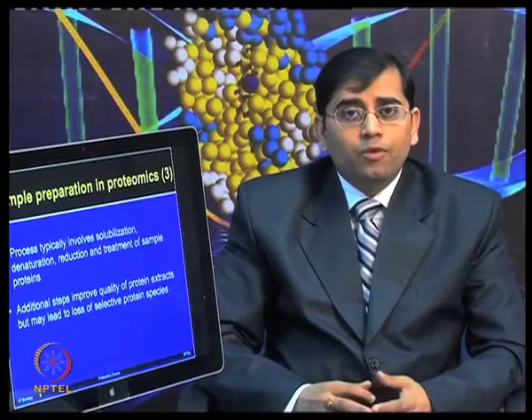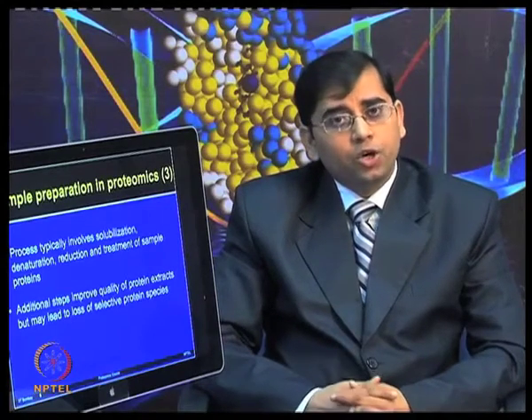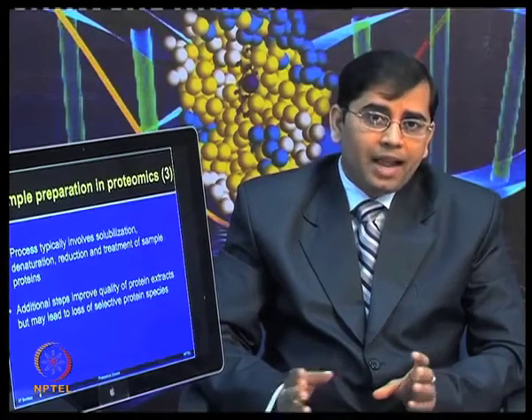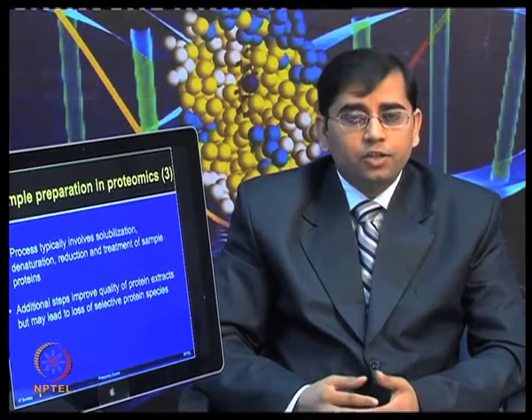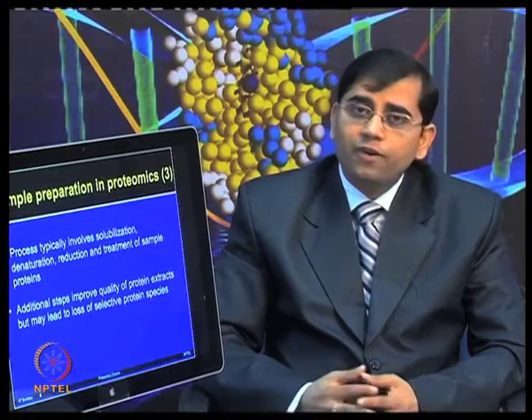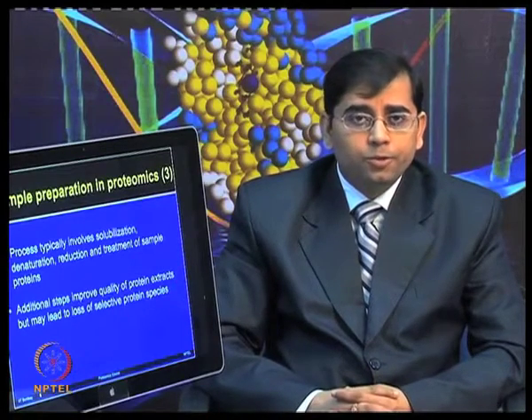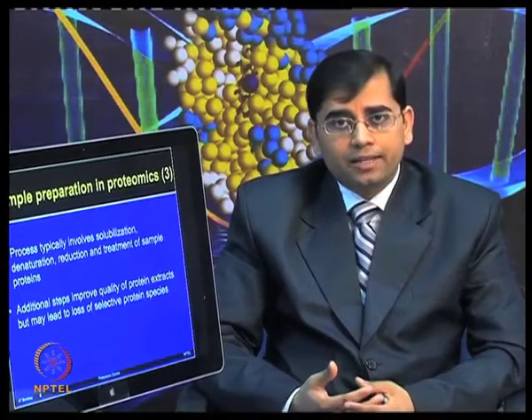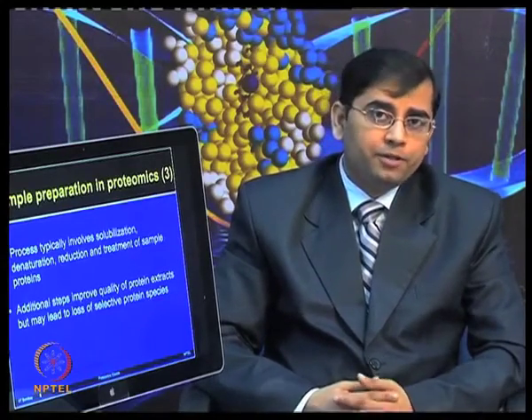And while you are doing this, you have to be very cautious that when you are performing various steps and sequential types of extraction, you may also lose a small fraction of the proteins. So, one has to be careful when adding additional steps during the sample preparation.